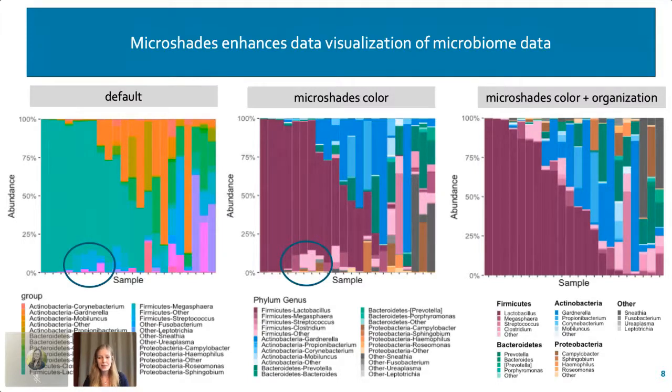As you can see, there are many benefits of using microshades, and a small change of using a palette that is CVD accessible will make your work interpretable to all.